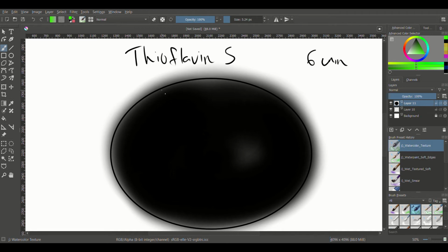So the first thing we'll do is deparaffinize and bring everything down to distilled water, and then we're going to rinse those with water, and then we're going to cover the slides with potassium permanganate. Wash that off, put it in potassium metabisulfite, oxalic acid, and agitate. So when we're doing this technique, there's a lot of agitation going on. We're going to wash that off, put it in sodium hydroxide peroxide, wash that off, do a final rinse with millipore filtered water.